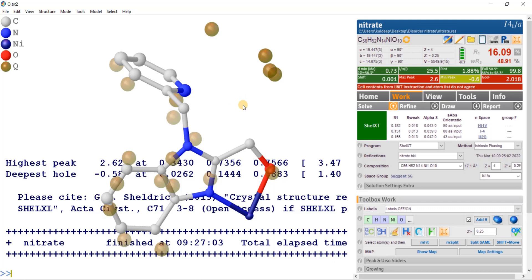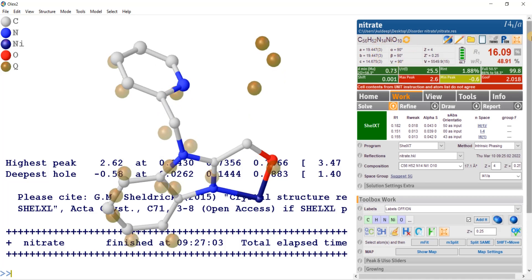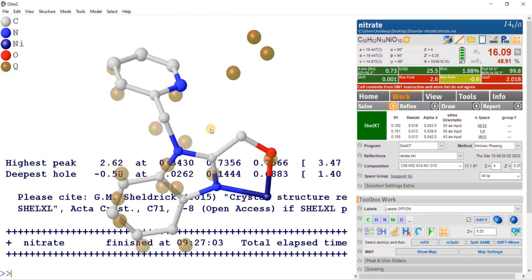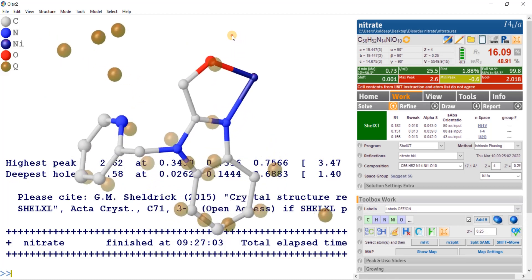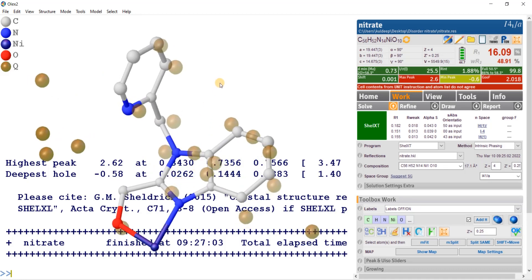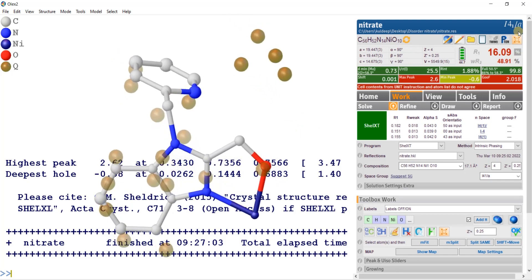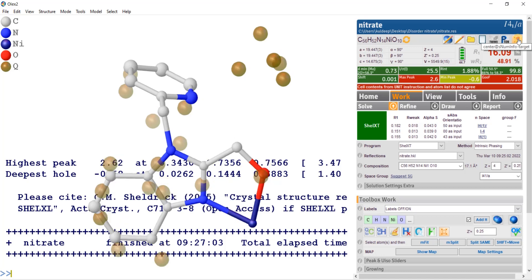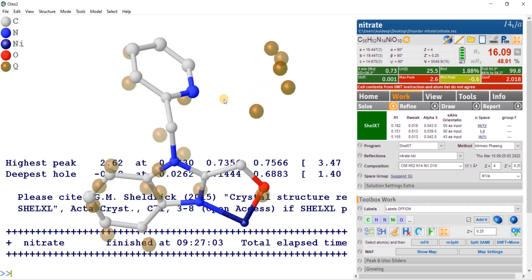This is a nickel 2+ complex that crystallizes in the tetragonal space group I41/A with only one quarter of the molecule in the asymmetric unit. The remaining molecule is generated by the crystallographic fourfold axis. Up to now all non-hydrogen atoms of the main moiety are defined isotropically, and we are still missing the lattice nitrate anion and some lattice solvent. I am going to press this button to compact the structure, and here I am getting some nitrate-like moiety and some water in the lattice.